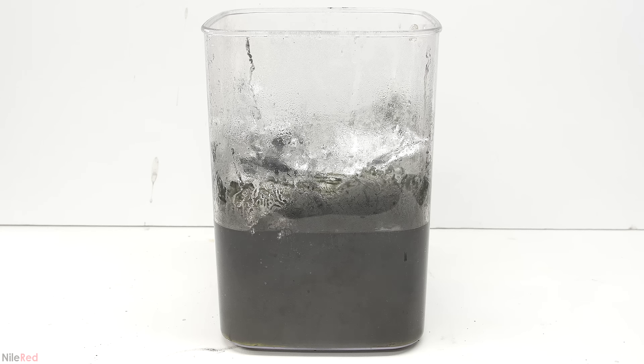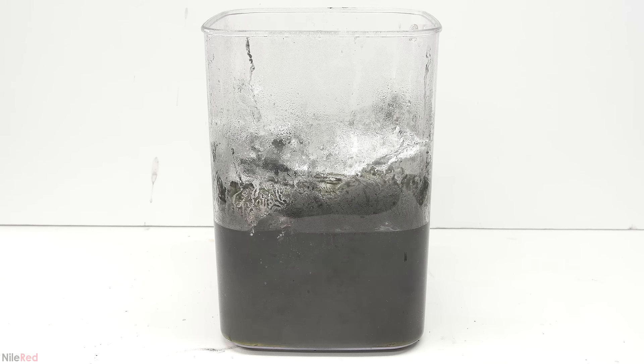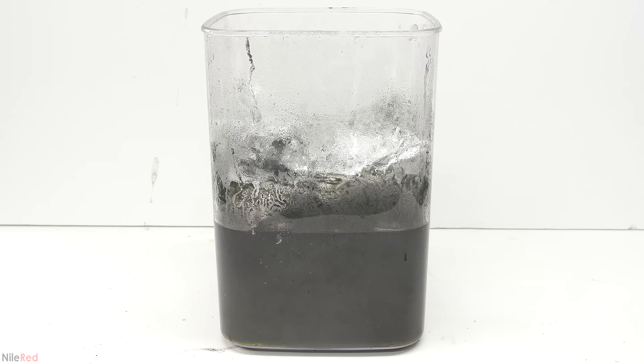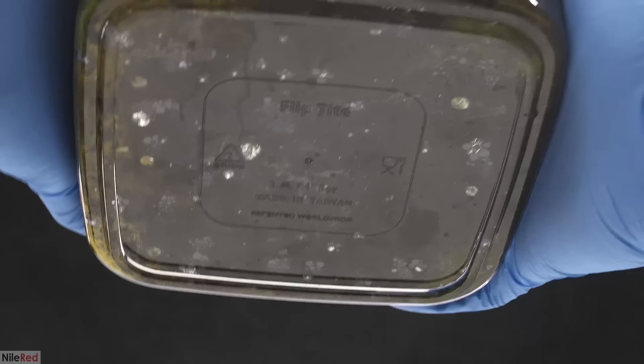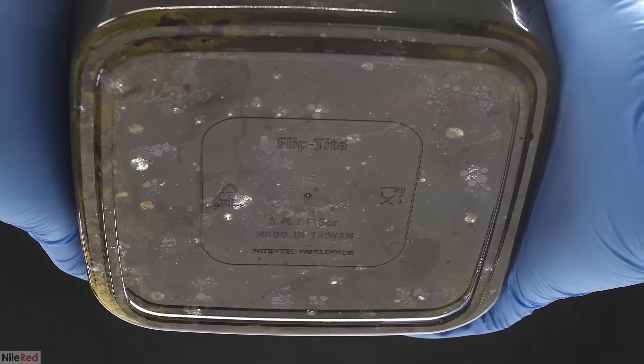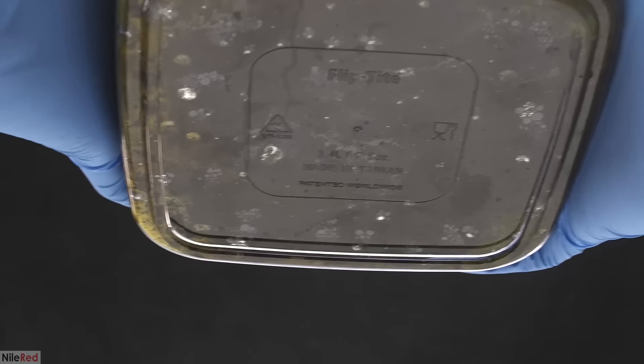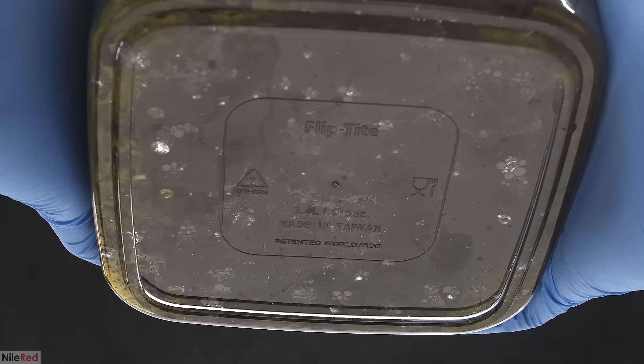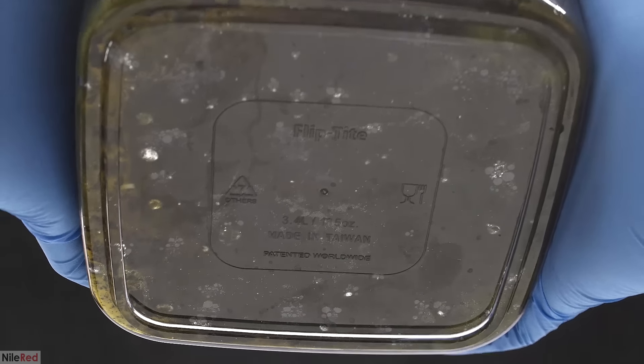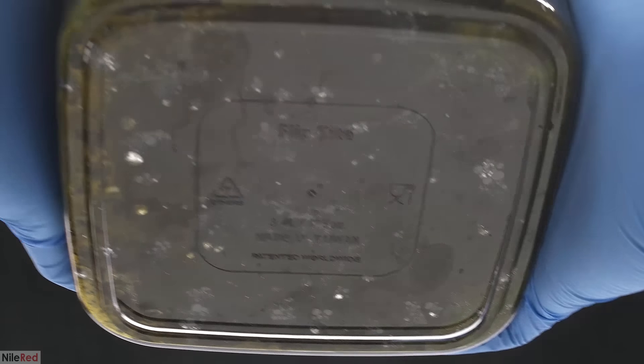As I continue to add more aluminum, the reaction slows down a lot and it becomes black. Aluminum foil is only 98 or 99% pure, and most of this black junk is likely just due to impurities. If I lift the container and take a look at the bottom, we can see a whole bunch of small mercury blobs. At this point I think I'm more or less done, but just to be sure, I did five more rounds of adding aluminum.